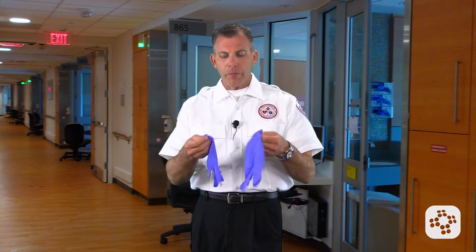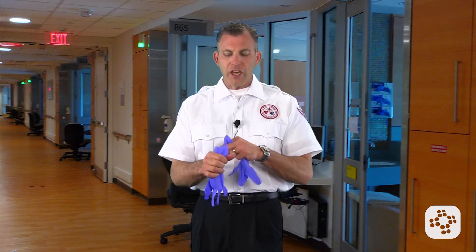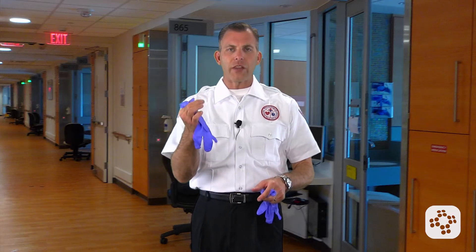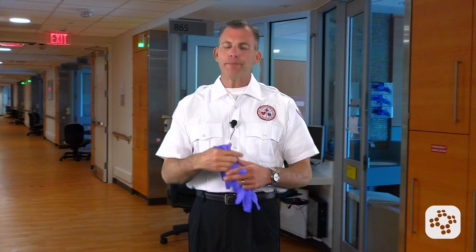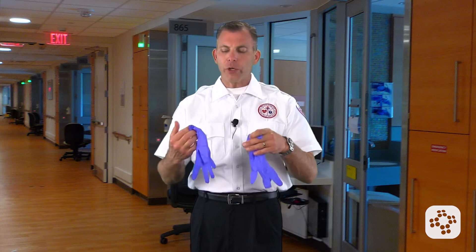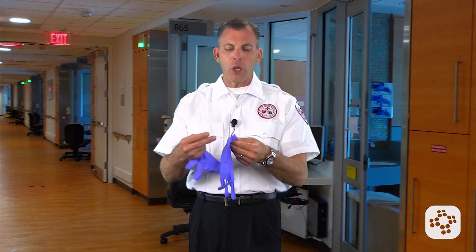When it comes to putting these on, some of this is common sense. But in EMS school, these gloves would stick together sometimes, and we would kind of blow them up a little bit. Not appropriate — we're not putting our mouths even to supposedly clean gloves. We also don't want to get germs on the gloves, so we're not blowing them up.